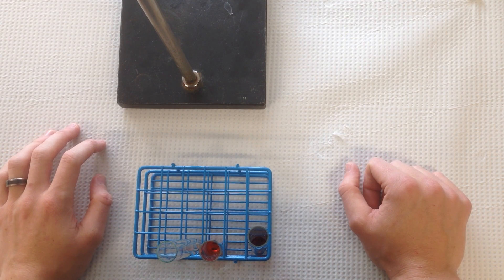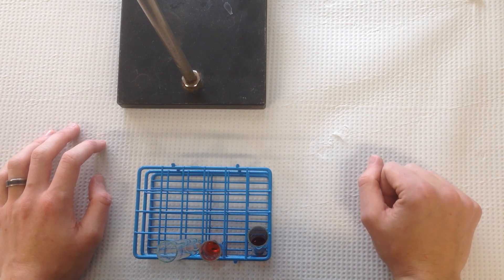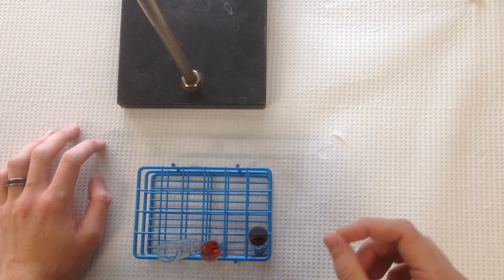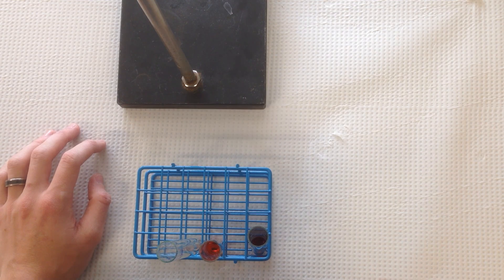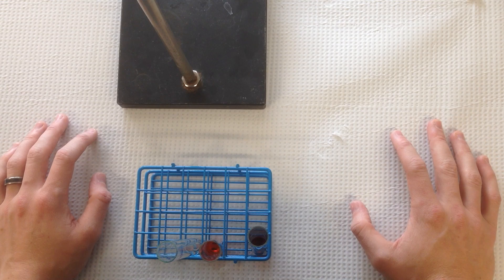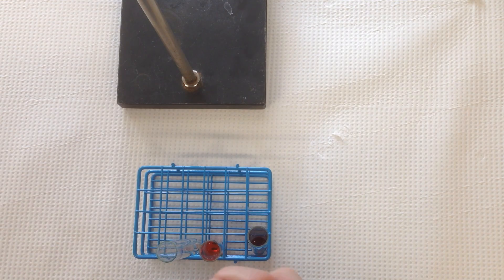Dr. Evans here with a couple of quick tips for the Equilibrium experiment. Keep in mind that there are two parts to this experiment. In Part A, we'll be using a relatively dilute solution of iron 3 cation and a relatively concentrated solution of thiocyanate anion to produce the iron thiocyanate product quantitatively.